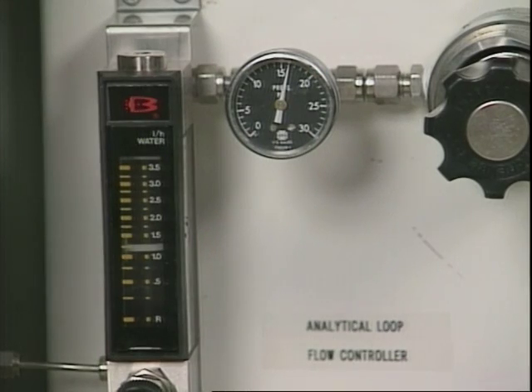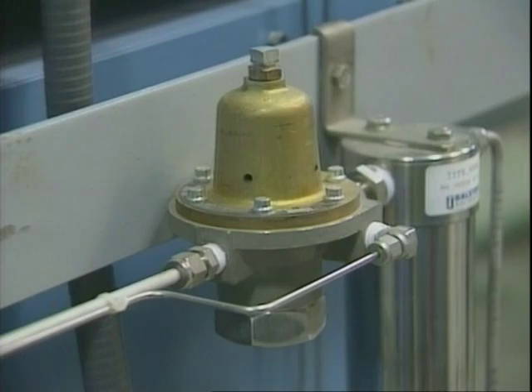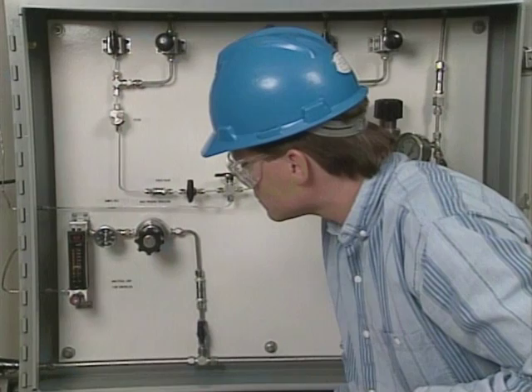Be sure to use a filter that is specifically designed for your system. The sample conditioning system also maintains sample pressure. Spectroscopic analyzers, more than other analyzers, require stable pressure in the sample cell since pressure affects the number of molecules in the sample cell. Pressure regulators may also be used in the process line to reduce process pressure to a safe working pressure for the sample system and the analyzer cell. Use of a pressure regulator can also provide a faster sample transport time.